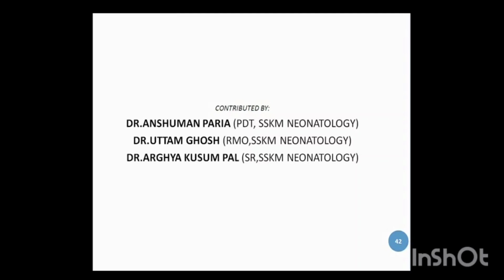Remember to change the infusion sets every day. It is better if you use another line for administration of antibiotics and inotropes instead of the line which is being used for total parenteral nutrition. It should be emphasized that only trained personnel should make parenteral nutrition. Using infusion pumps is a must for administration of the total parenteral nutrition.